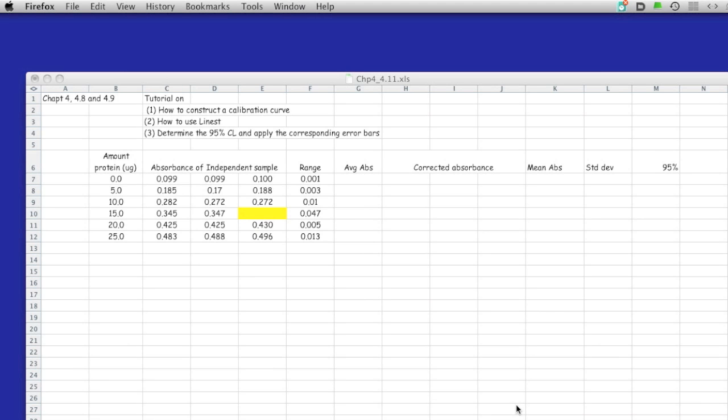This is a tutorial to show how to use Excel to construct a calibration curve, to use LINEST and determine the 95% confidence level, and then apply the corresponding error bars in the graph. In this example, we have absorbance data in which different amounts of proteins are determined. The data shows the absorbance of three trials with samples ranging from 0 to 25 microliters.